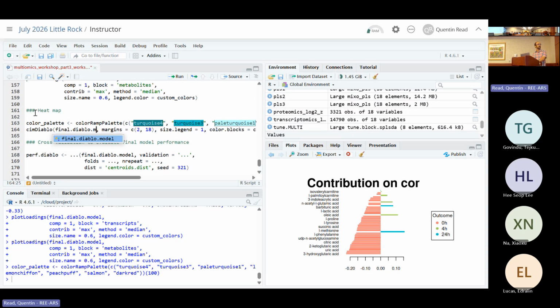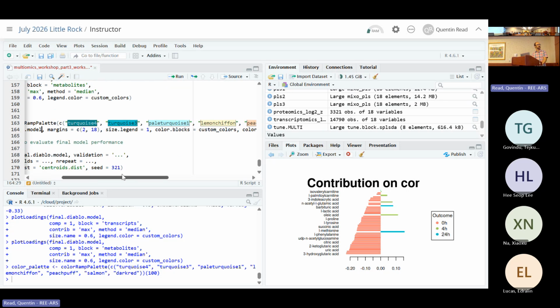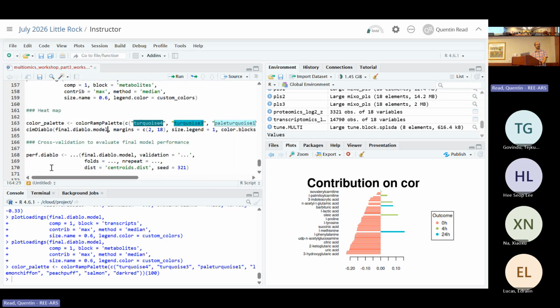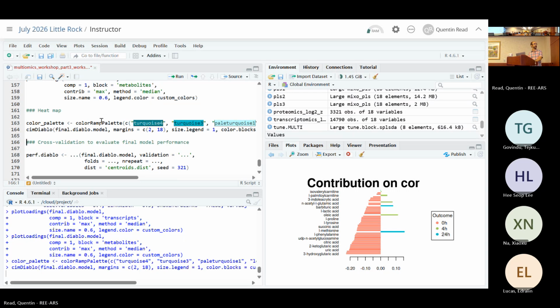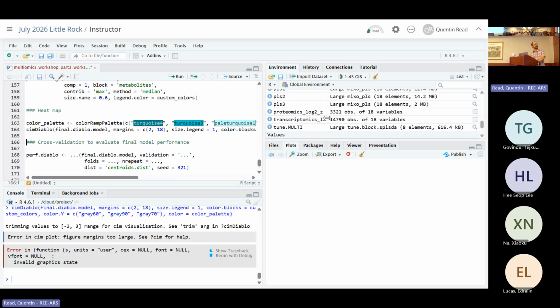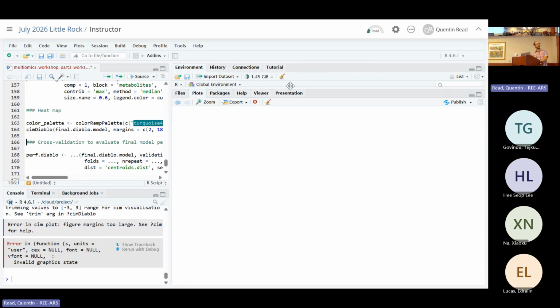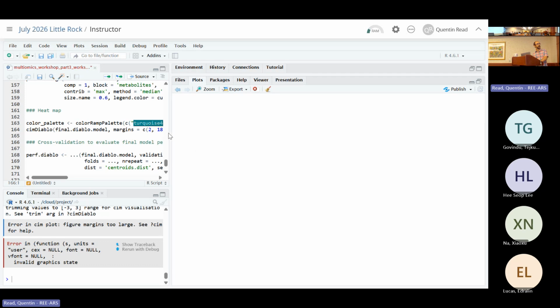And if you scroll over, you can see all kinds of arguments that were put in just to define the color scheme. All that stuff's not really necessary, but it just defines the color scheme to look the way we want it to. Oh, and it doesn't work because we don't have a big enough window, but that happens on this small screen here. But if I make this bigger, it should work, at least temporarily.